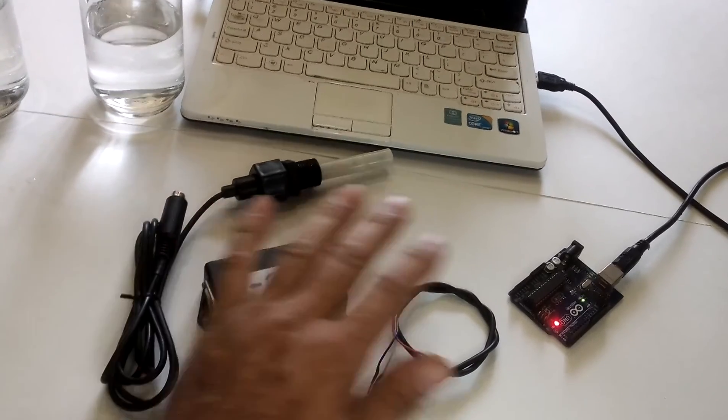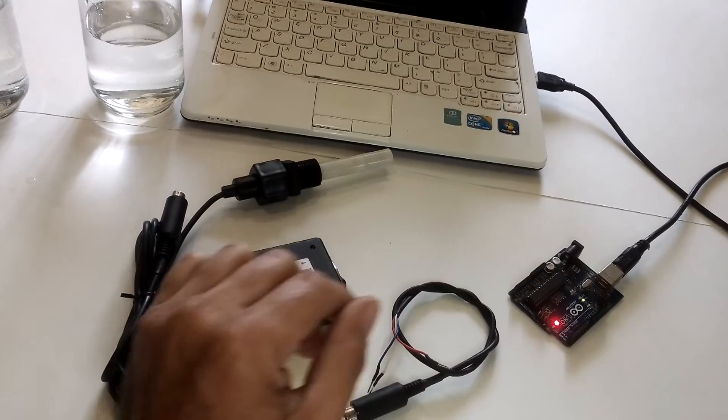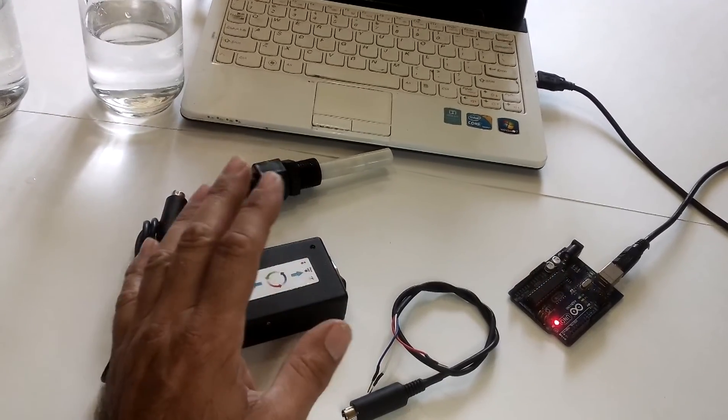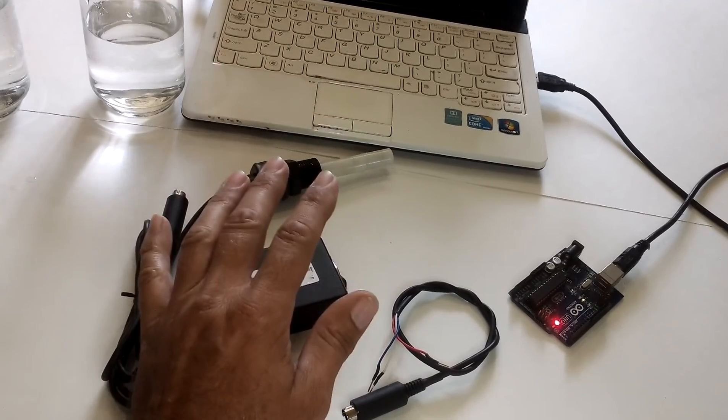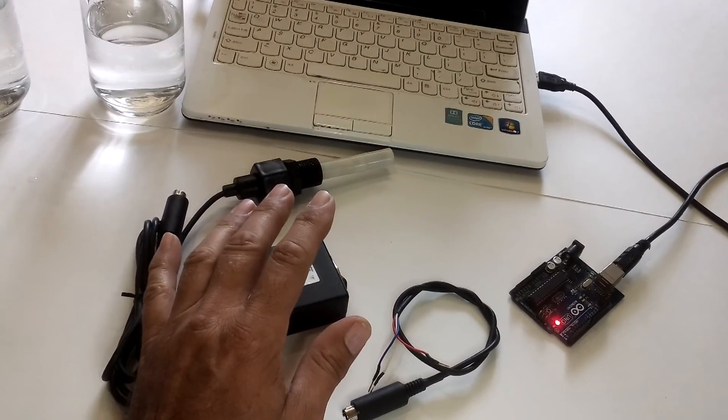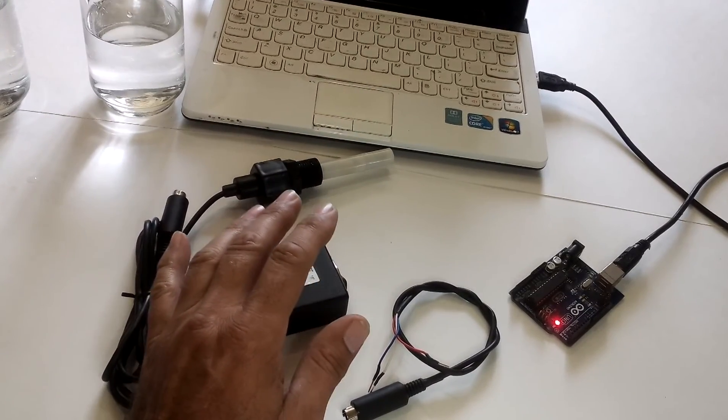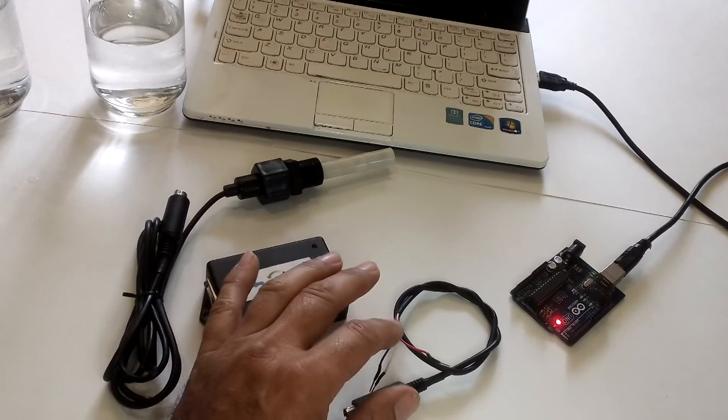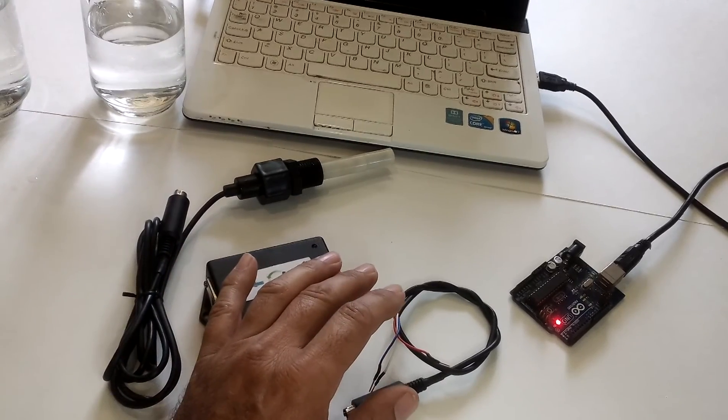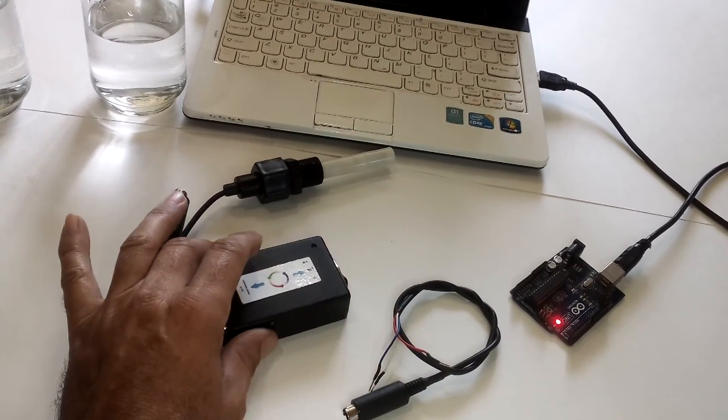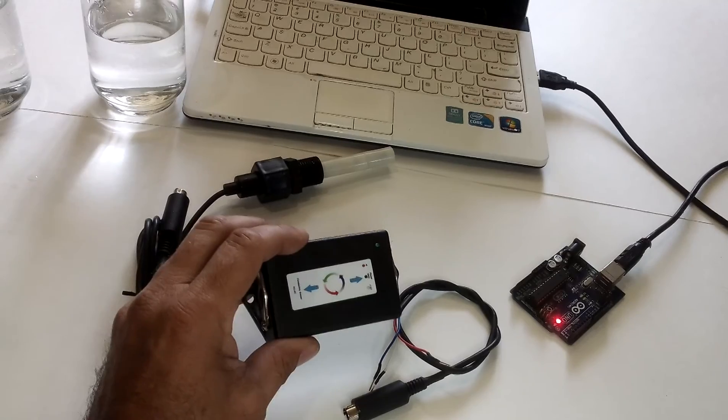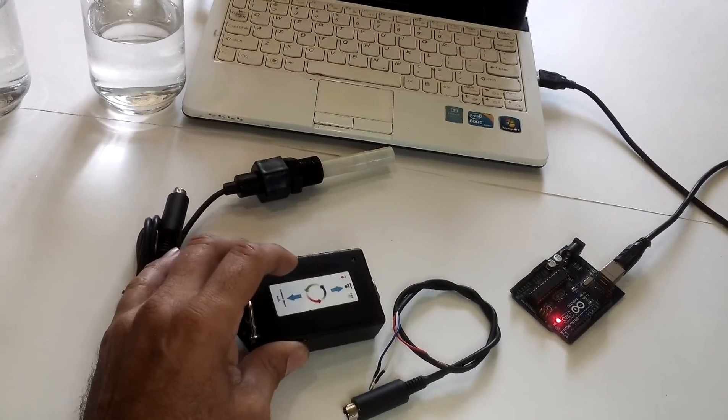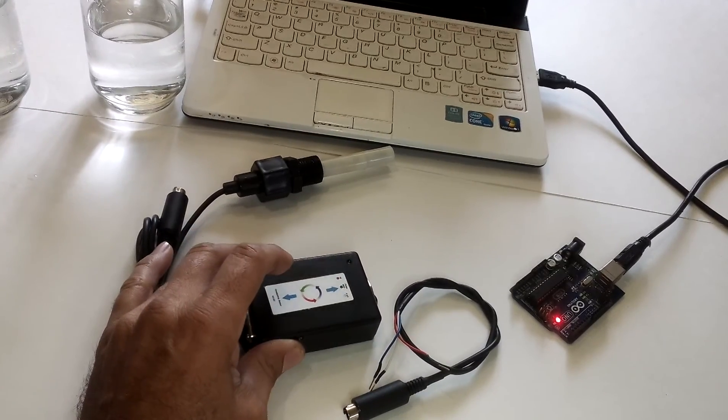In this case we're going to use Arduino Uno and I've already uploaded the sketch, the analog serial in and serial out and we're going to measure the EC of the water, electrical conductivity.